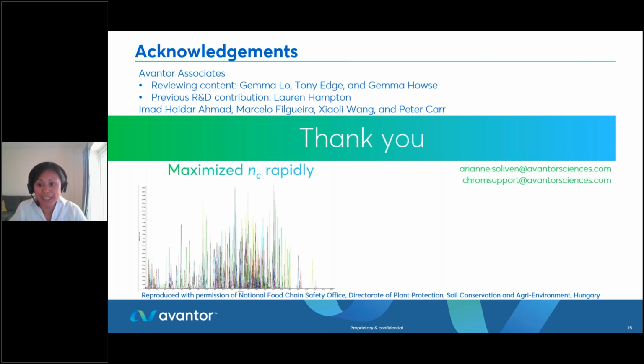Thank you for that question, and thank you for the listener who's breaking the ice and bringing that question in. Those are very good questions. I think quality by design, quantitative structure-retention relationships, and computational strategies, if you have access to that, I would recommend please use that.